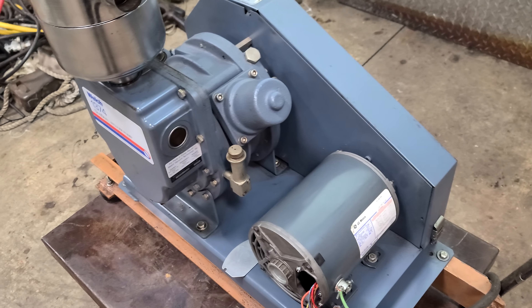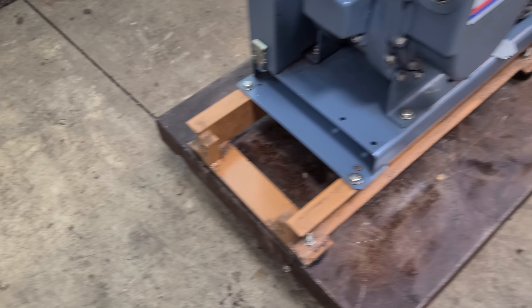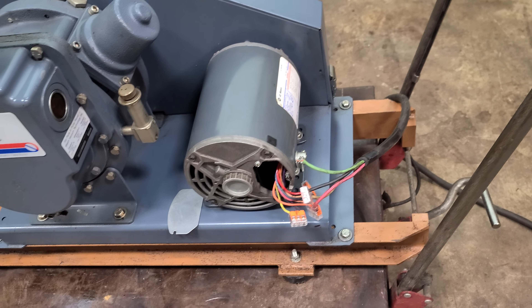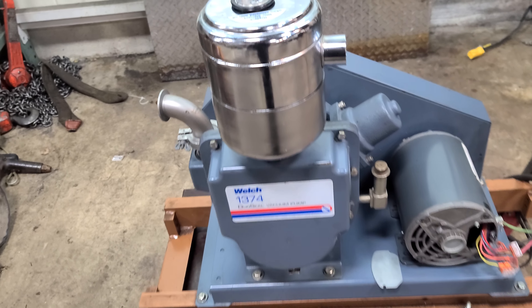It's currently wired — temp wired — 230V, 3-phase. It came out of a vacuum coater. It's mounted to this base; the base is really heavy. If you don't need the base, it might save you 150 pounds on the shipping charges.